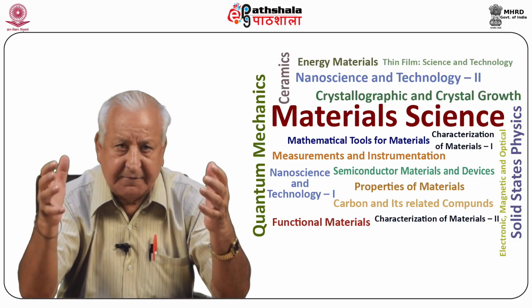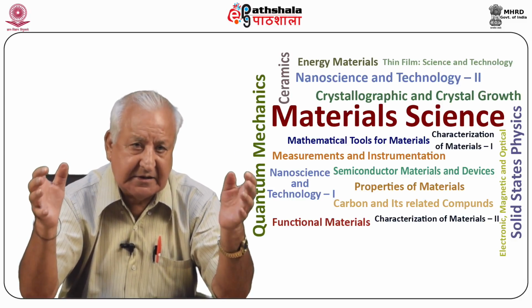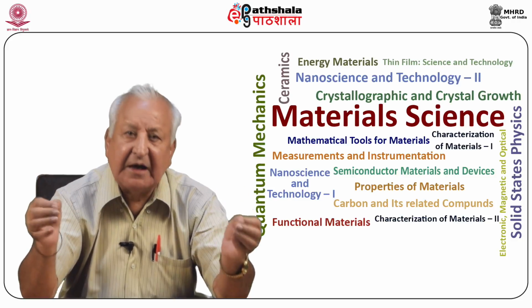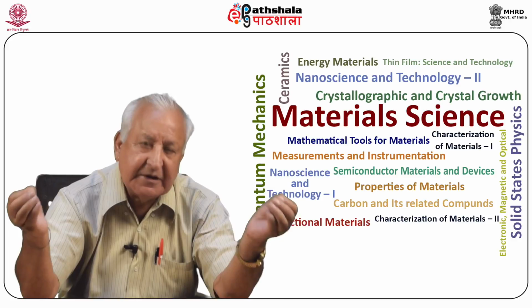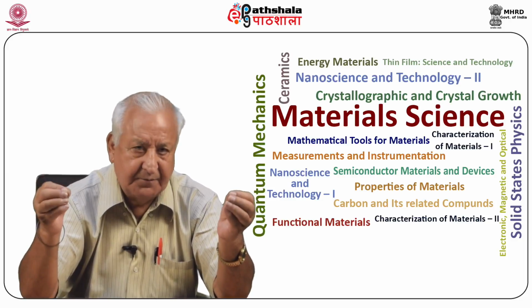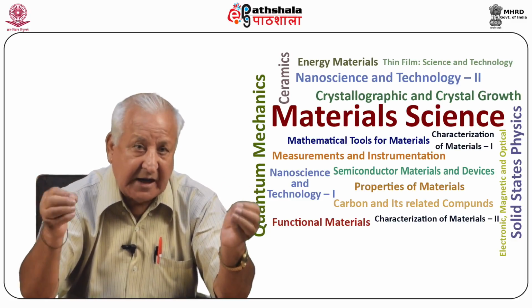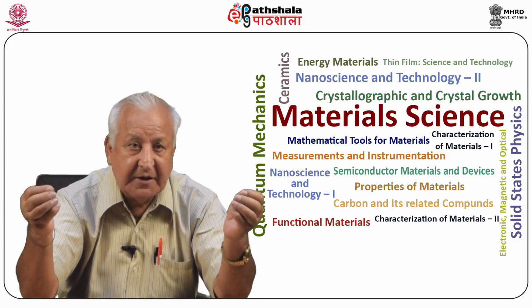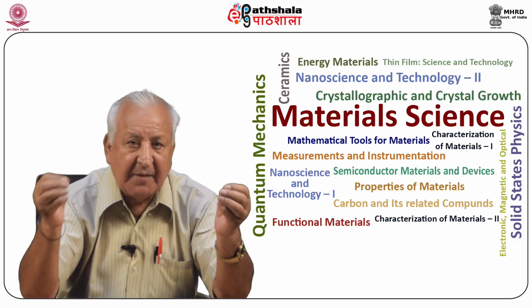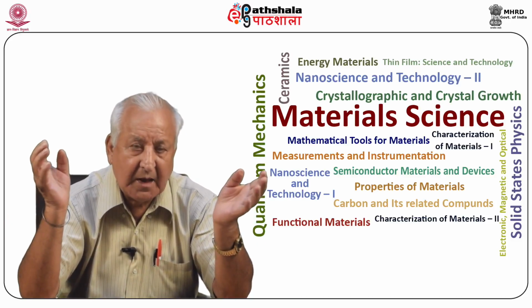Indexing of powder photograph. The procedure of indexing of the powder pattern is based on the type of crystal classes that one is dealing with. It depends on the following: substances whose unit cell is known, and substances whose unit cell is not known. For substances in category 1, indexing is rather simple, whereas for category 2, indexing is not that simple. For the latter type, trial and error methods are adopted for assigning indices to the powder lines. Let us first know very briefly about the method of indexing powder lines of those substances whose unit cell is known.